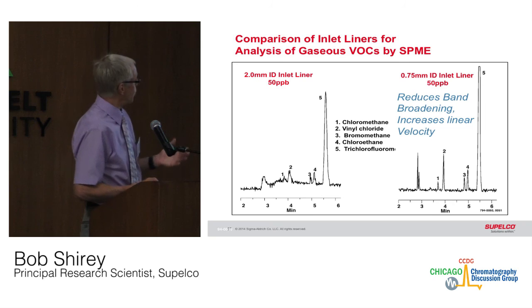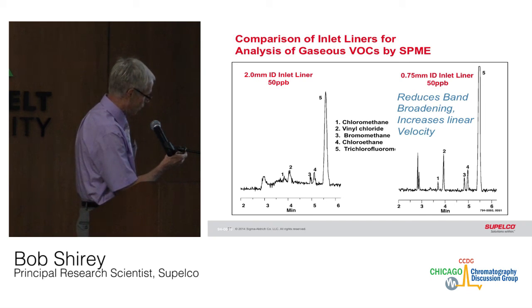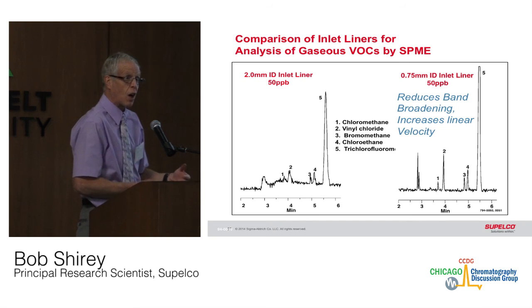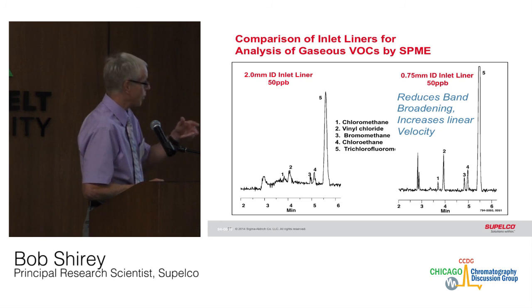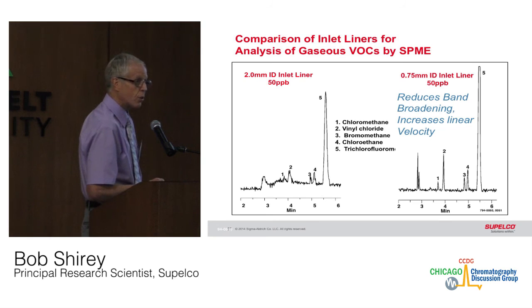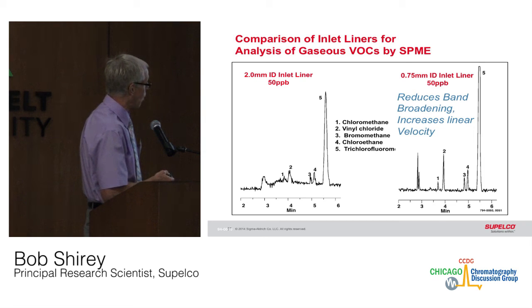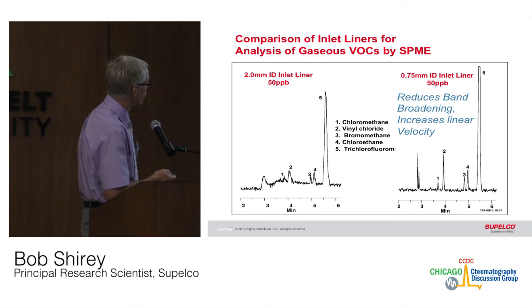The only modification we recommend for an inlet is to use a 0.75 millimeter liner. This reduces band broadening, increases the linear velocity of the gas through the liner, and pushes the sample onto the column much more readily. Now you'll also want to couple this with a thick film column if you're doing a volatile analysis. In most cases, you won't need to use cryofocusing.